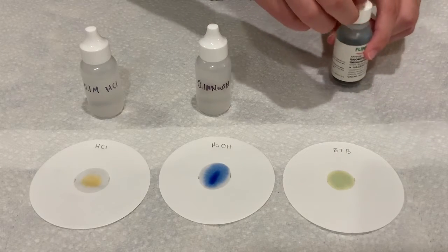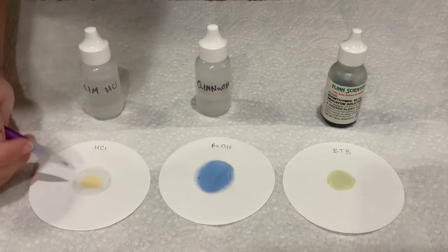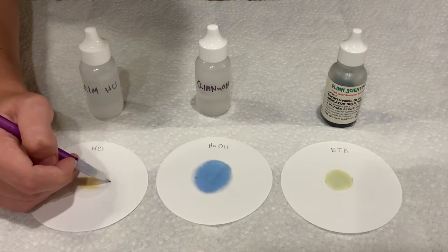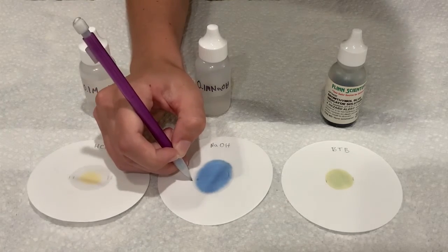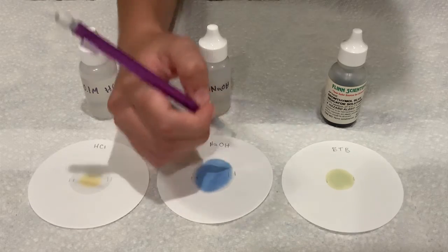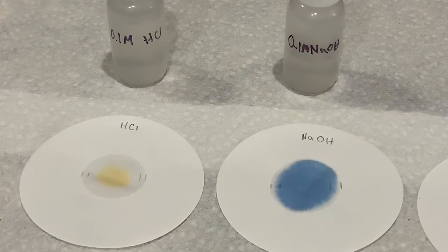See, there's a pretty significant color difference between the two. HCl looks pretty yellow, and the NaOH looks like a pretty bright blue. And the just bromothymol-blue has sort of a greenish color in between. So there's a close-up of each of those.